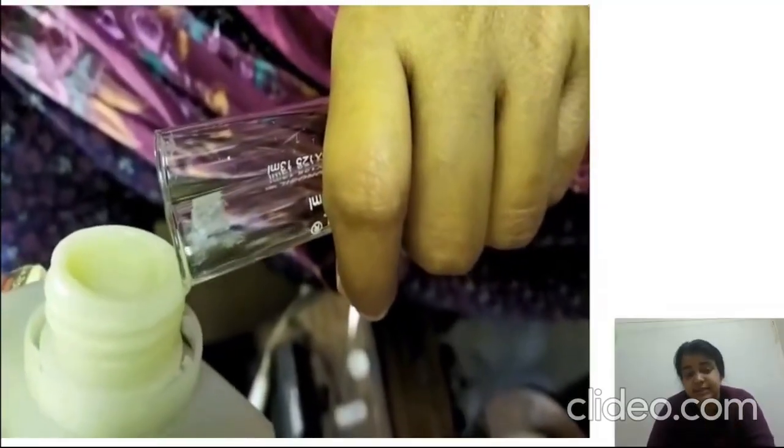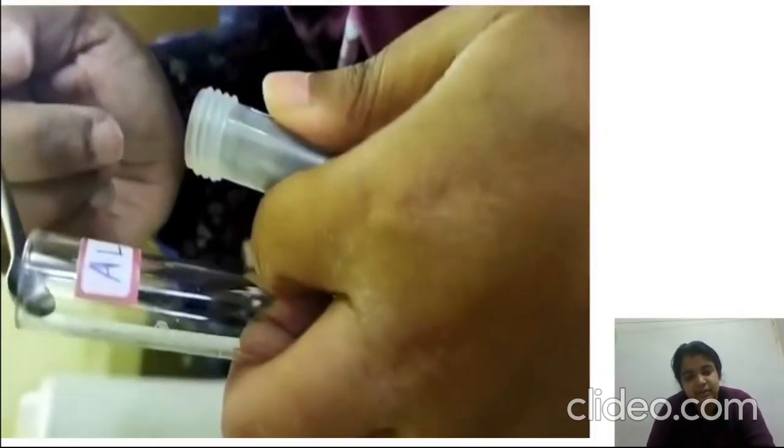Here the whole process of this TEM study is now shown in this video. At first we have to prepare the sample for the TEM study. To prepare the sample solution, at first we have to take some amount of ethanol in a test tube, and then add a very small amount of sample, a pinch of sample, in the ethanol, right?